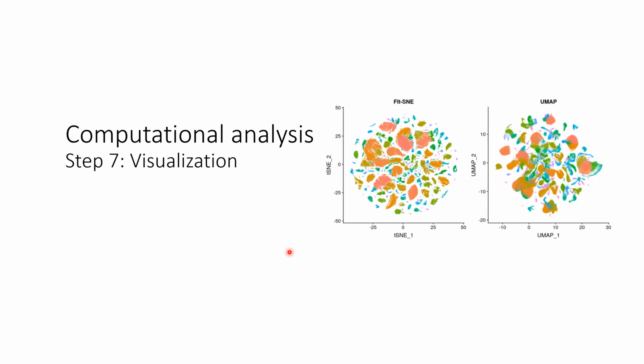Though in a recent work from the lab that I work in, we showed that this practice of reducing the dimensions of your data at the elbow might not be the best approach to preserving the topology of variation in gene expression space. But in general, people just visually inspect and look at the elbow and decide that is where we will cut off the number of dimensions that we use to project our data.